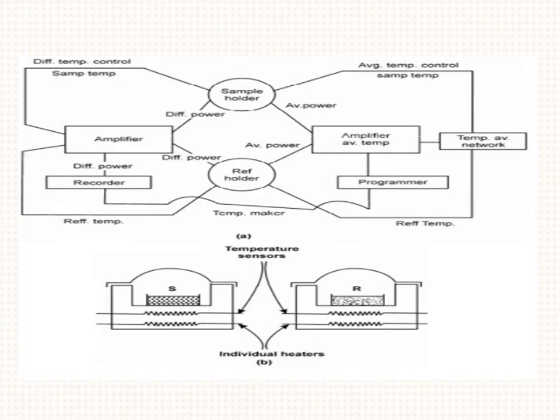So in the diagram you can also find the same thing. Everything is monitored automatically, so the programmer will be present. The amplifier is able to identify the temperature, and the temperature will also be controlled automatically by the programmer, and we will have a record at each and every stage.